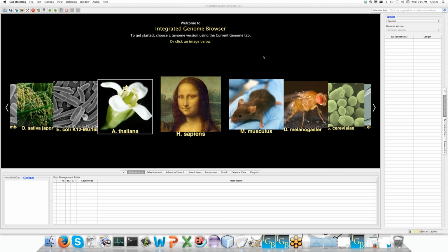Most people in the audience have worked with IGB, but I am going to start a little bit from scratch just so that anybody watching this can catch right up with us. So the first step is opening a graph in IGB.